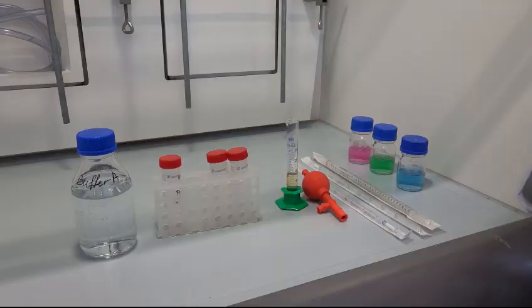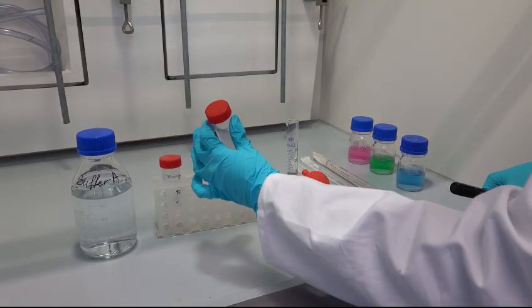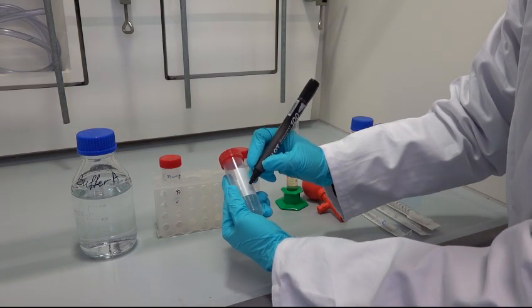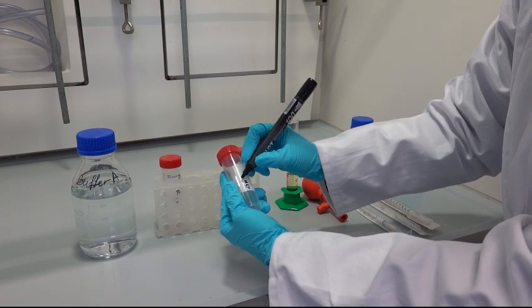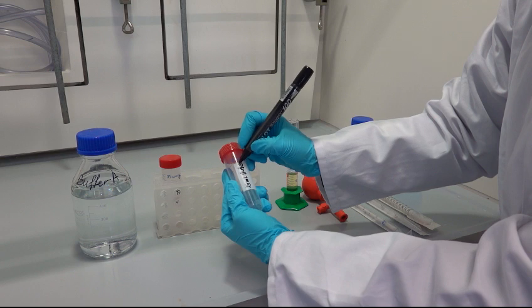In the last step we are adding buffer to previously separated egg white, which was added to the cylinder and stored on ice. Regularly, to 5 ml of egg white, 25 ml of buffer A is added. In our case we prepared two aliquots to work with.